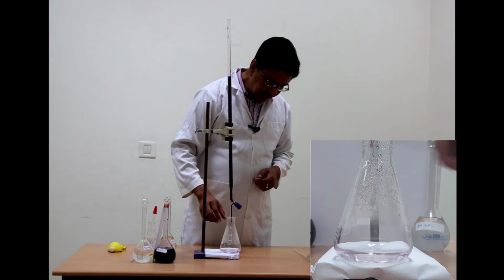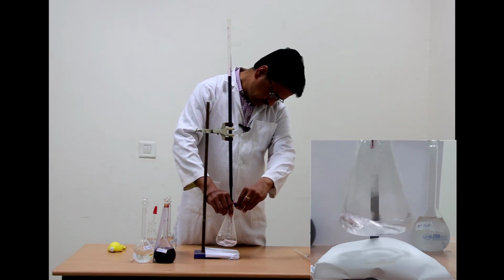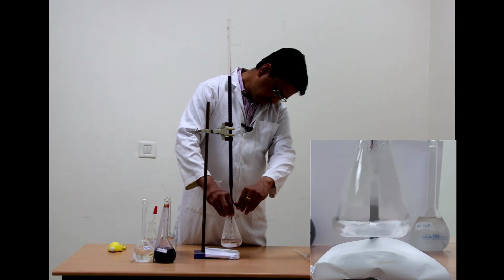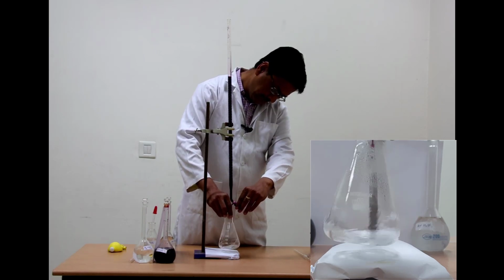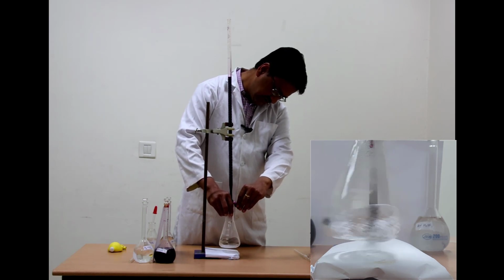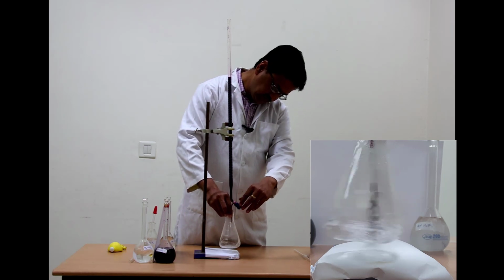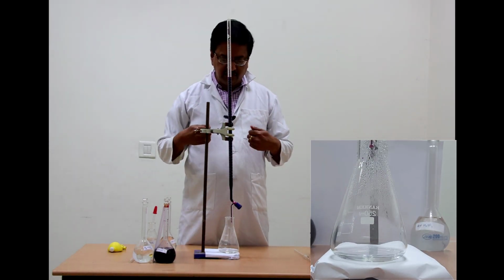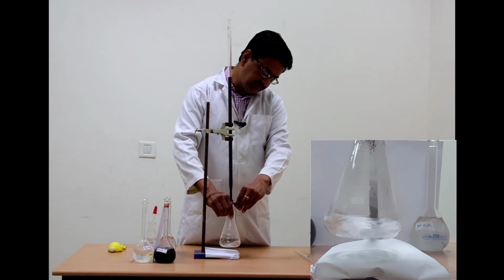So this initial color is due to the slowness of this reaction. Now when I add the subsequent drops of permanganate, the color of permanganate will decolorize immediately. You see, immediately on addition of drops of permanganate, the color disappears. So this indicates that the Mn2+ that is getting generated during this titration is catalyzing this particular reaction between oxalic acid and potassium permanganate.